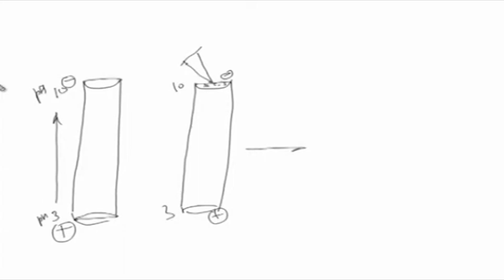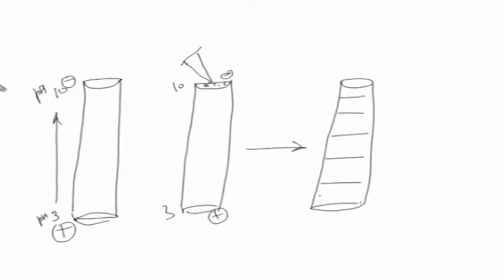So, when you apply the electric current, what you will get are different bands, which could be visualized by staining. The same will happen in a slab gel, for example, I can just show you here.